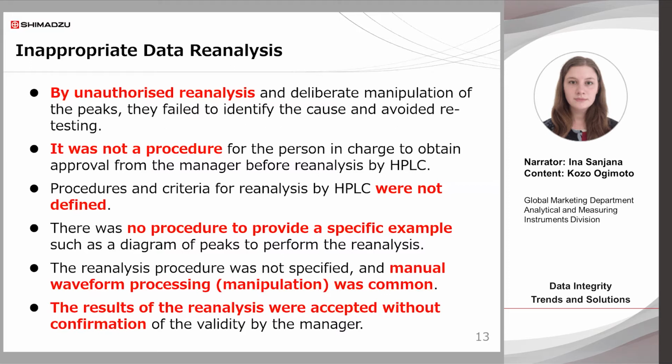As you can see, the authorities also found cases where procedures and criteria for reanalysis were not defined. There was no procedure to provide a specific example for reanalysis, or manual waveform processing, that is, manipulation, was common. The last point is that the results of the reanalysis were accepted without confirmation of the validity by the manager. The manager should make a decision on whether or not to conduct a reanalysis, and when conducting reanalysis, it must be done according to the procedures determined in advance, and the validity of the results must be confirmed.